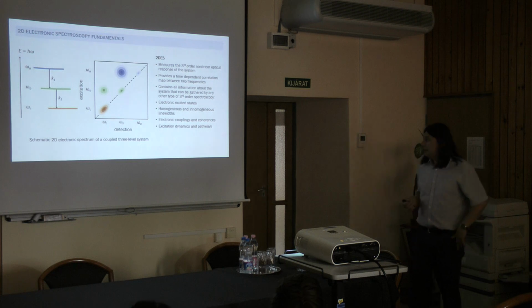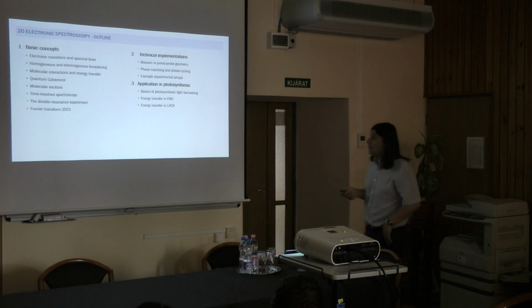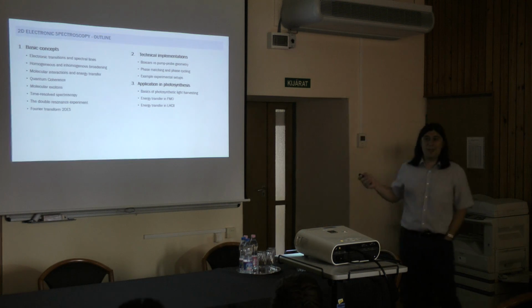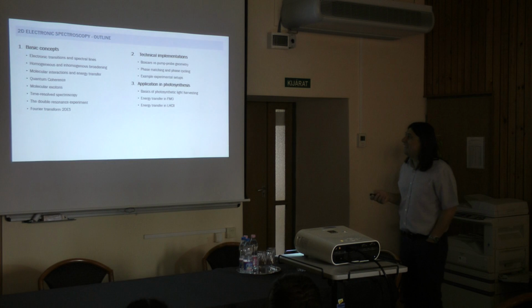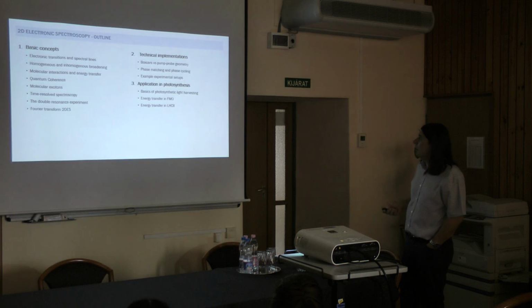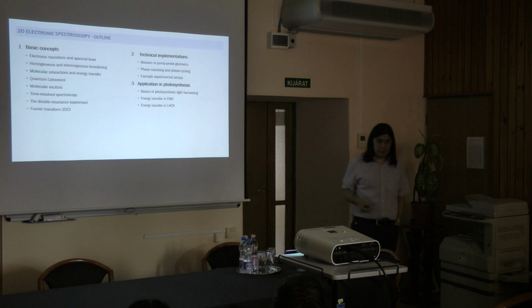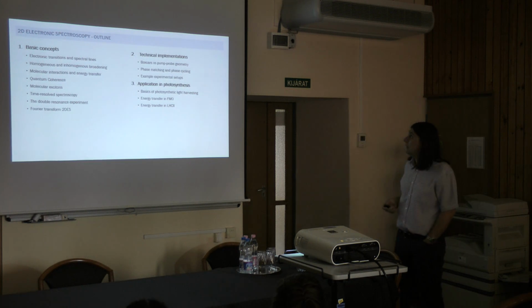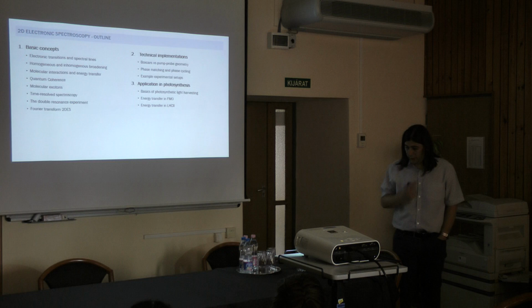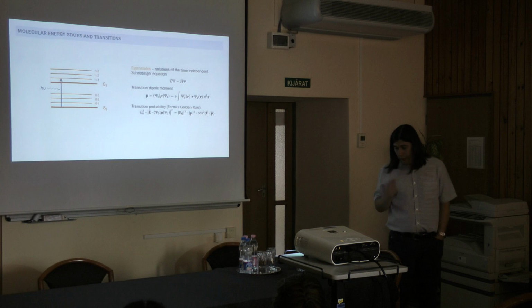All right. So we can take it easier at first and introduce some basic concepts, very basic. Sorry guys there, you will have to survive that part. Basic concepts and fundamentals, and that will be the first part, and then we can talk about several implementations, how to build the instruments that will give us such two-dimensional spectra, and finally I will just show you some examples in photosynthesis on light harvesting complexes.